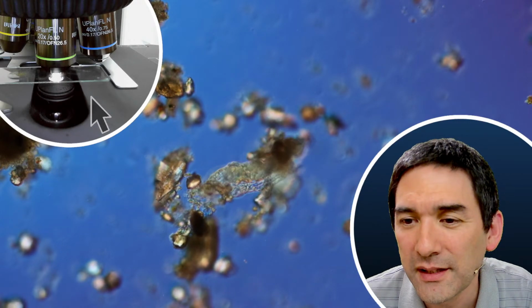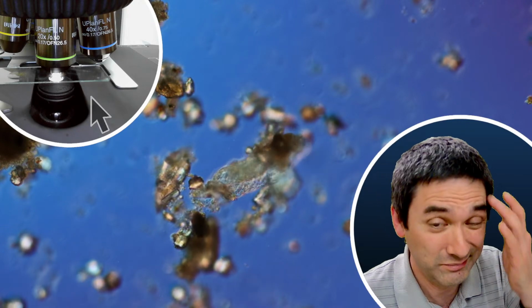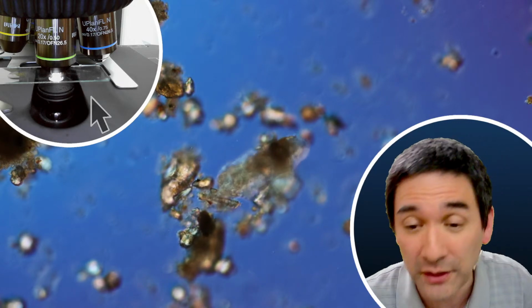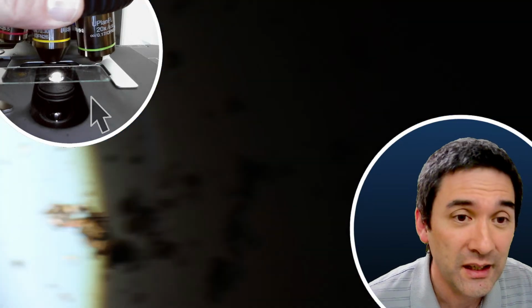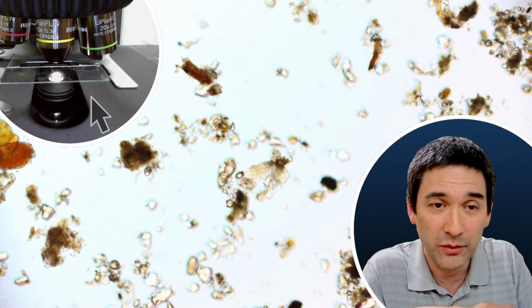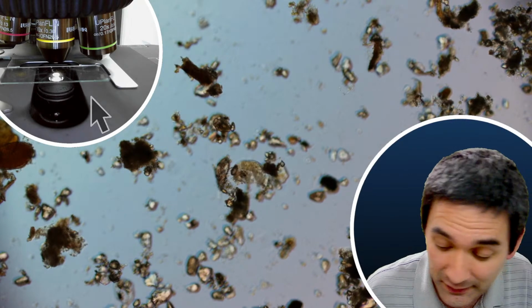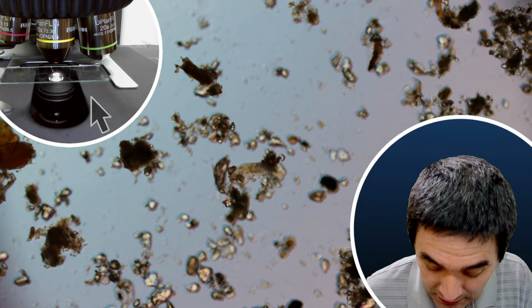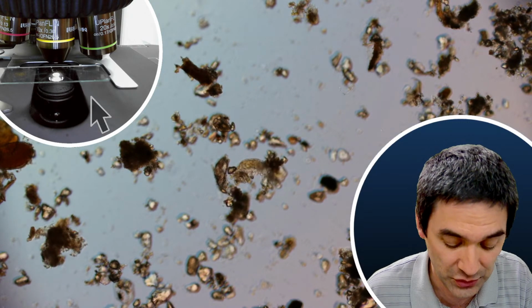Can we look at another sample? Okay, I would like to see more. Okay, you know what? Before I do that, I'm going to risk something now, because I've been talking anyway over an hour now, so it's possible to risk the following. I'm going to add a cover glass to this. It's going to spread everything, and I might have problems finding the tardigrade again. So I'm not going to spend a lot of time searching for it now if I lose it.